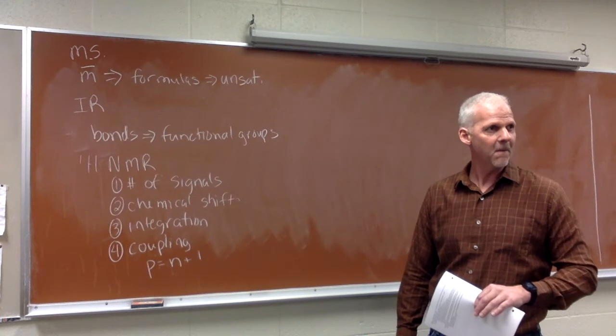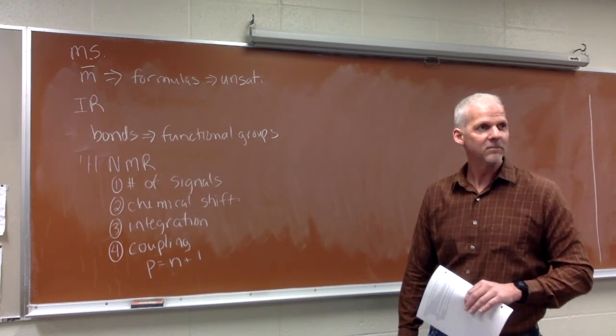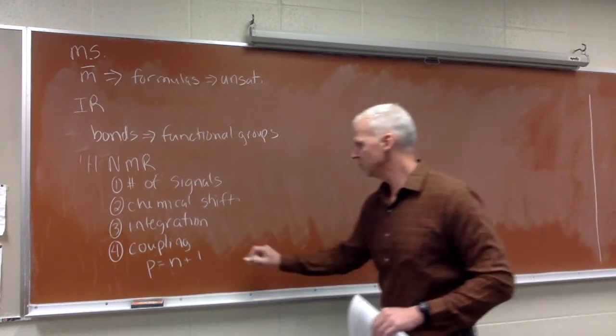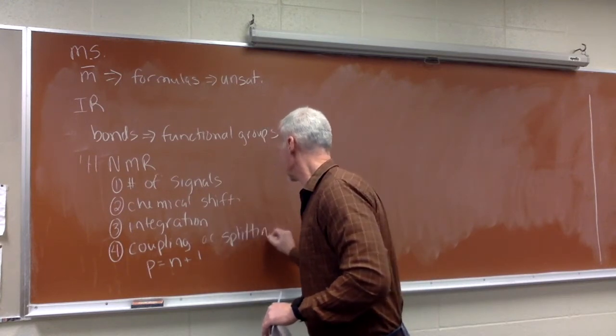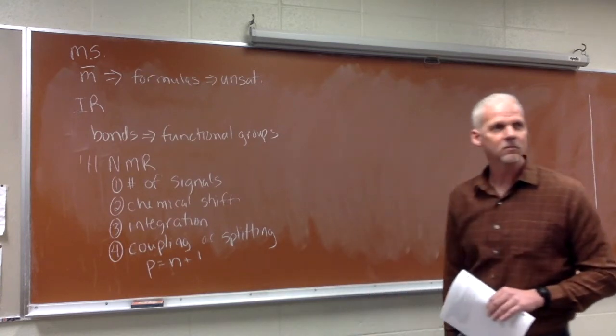Anything to add, Dr. Riley? Not really. We sometimes call it coupling splitting. I think that's what it kind of refers to it a little bit more, but it's the same idea. Yep. So what do we have to add to that?